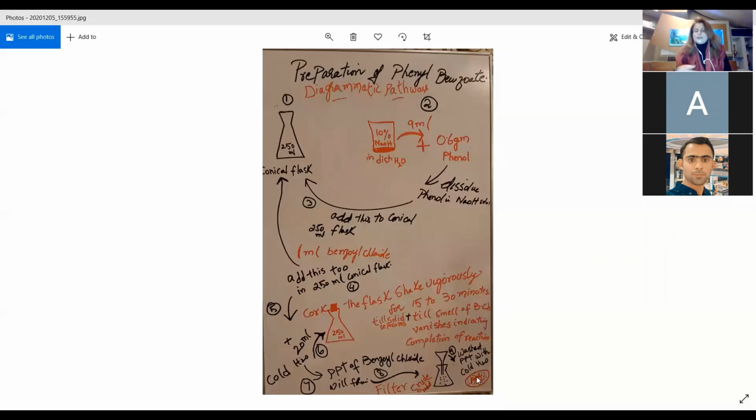I've made a red drawing so that you can have full focus on the red color of the precipitate, though they are not red in color, they are white in color. Okay, keep that in your mind. It's just for gaining your attention. I chose the red color.